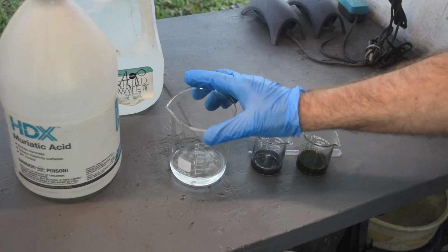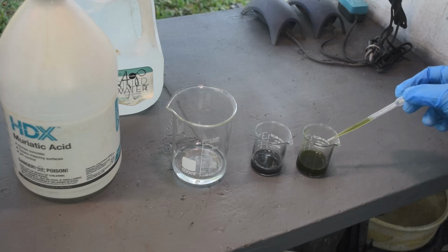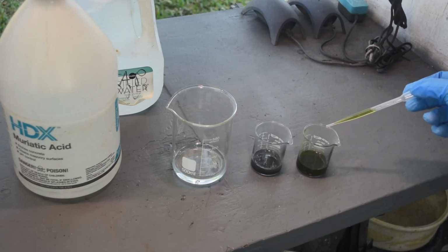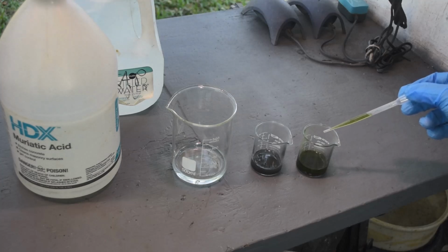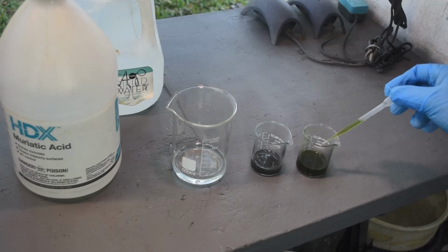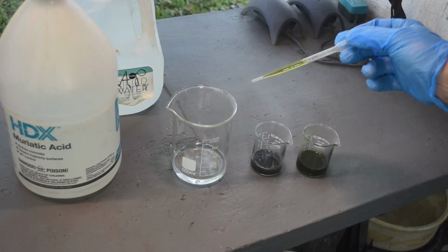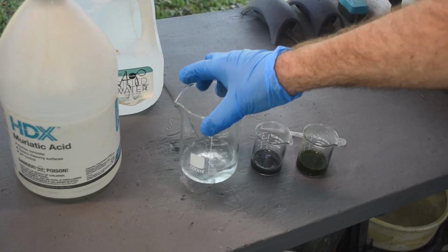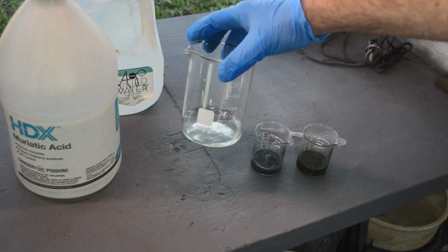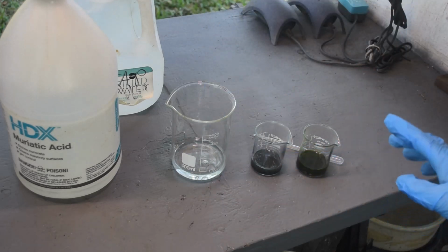I don't know. And also I want to test this stuff because silver chloride can go into solution in highly acidic environments. So it's possible this might be holding some silver chloride in it. Now, this is very strong acid here, but this is very weak over here. As the pH rises when I put it in here, the silver chloride ought to come out of solution if we're carrying any. So let me put that in there and see if our turbidity is any worse. No, it's not.